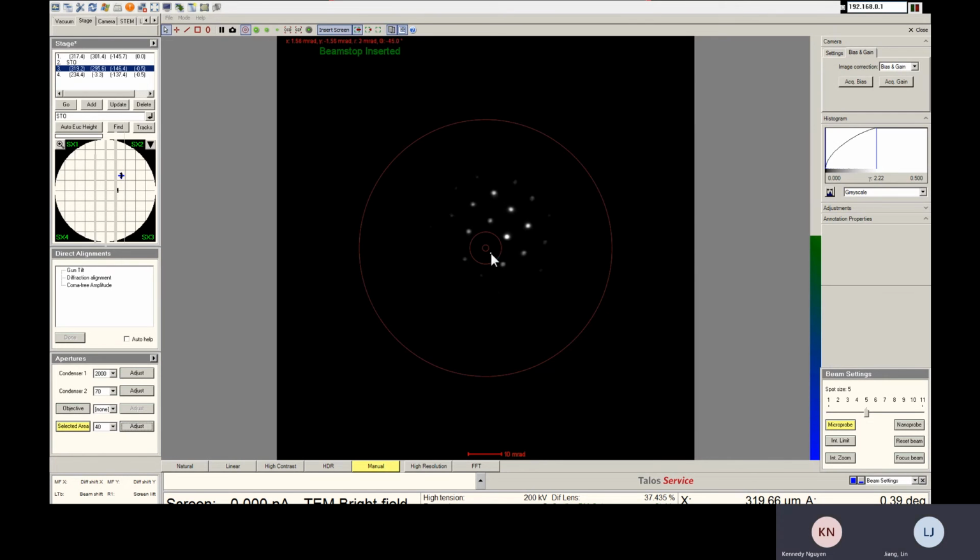Is this just because of where we're at that it seems like you only see this side, we don't really see this side? Yes, the sample is not flat. You can use the diffraction element, bring it to the center. Your sample has some curtaining, right?